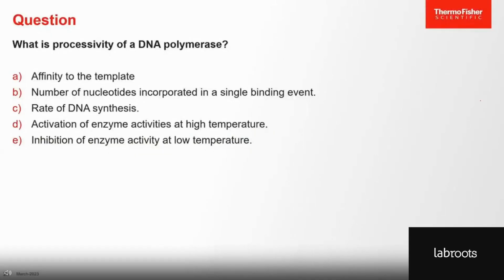Correct answer for this one is our letter B. Nucleotides incorporated in a single binding event.